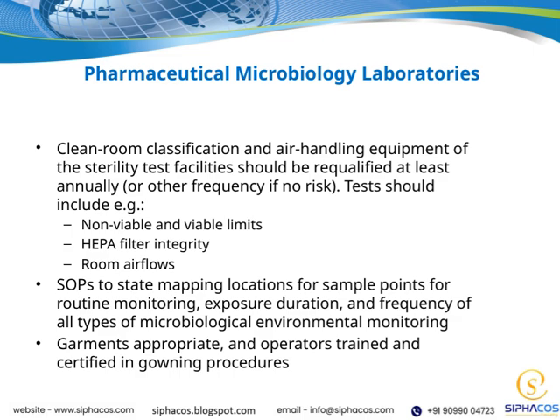Operators should be appropriately dressed in garments designed for clean environments, and they need to be trained and certified in gowning procedures. Proper gowning minimizes contamination risks and keeps our sterile environments safe. All of these measures are interconnected and essential for maintaining the integrity of our sterility testing process, ultimately ensuring the safety and efficacy of the pharmaceutical products we produce.